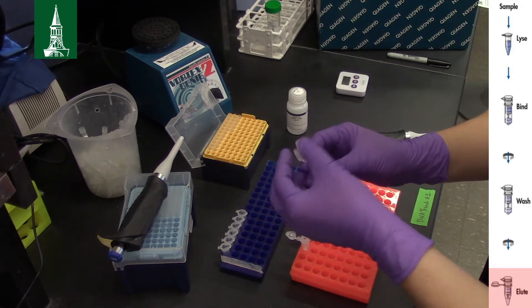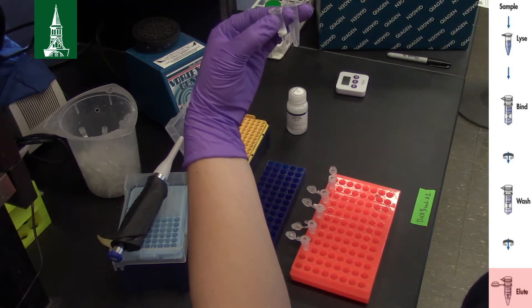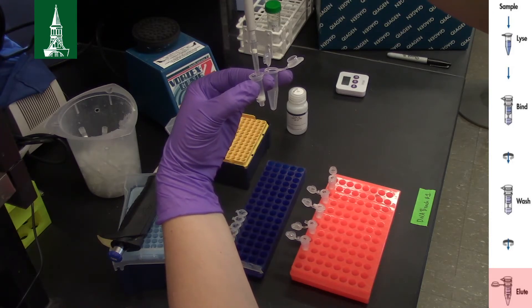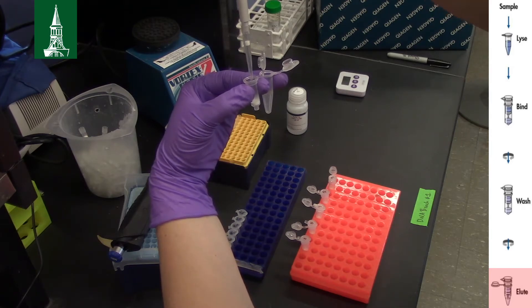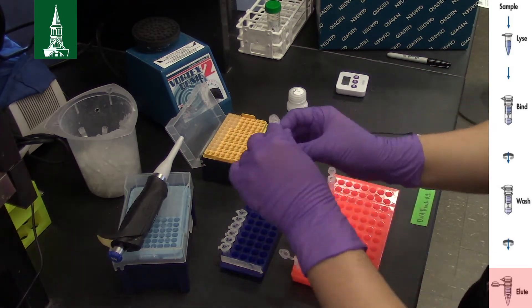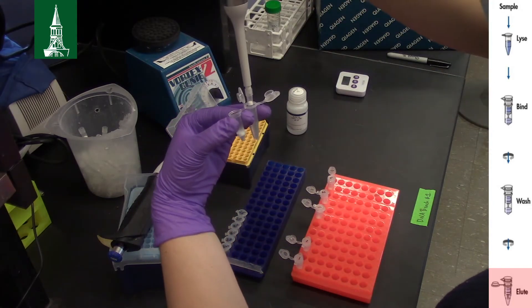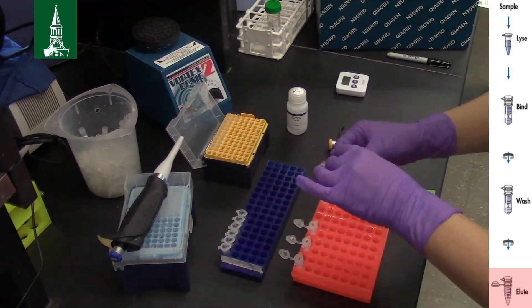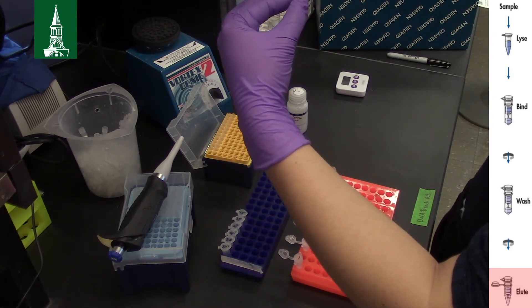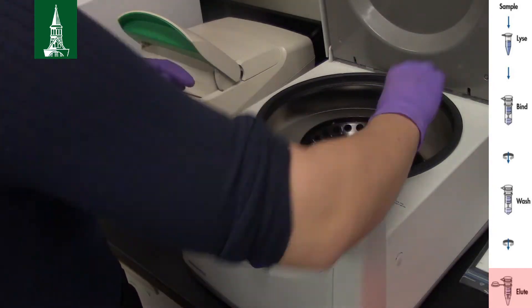To increase final DNA yield, pipette the flow-through directly onto the membrane in the spin column. Centrifuge for 1 minute at 8000 rpm.